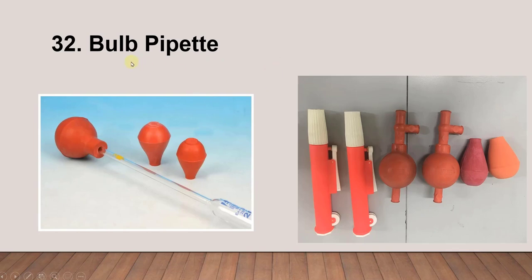Next is the pipette filler. When you work with a pipette you need a pipette filler to withdraw the solution. We have different shapes and types of pipette filler.